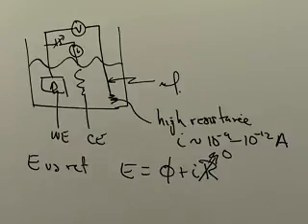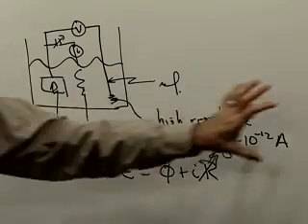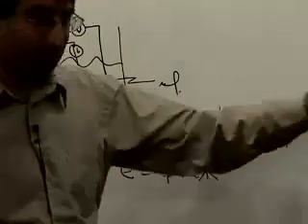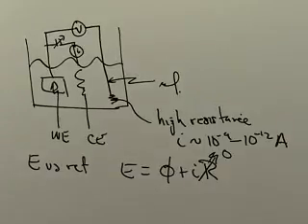Now, having said that, if you work at it really hard, you can mess yourself up and get such a high resistance between your working electrode and your reference electrode that even the trivial current is a problem. If you really want to mess this up, put a 5-foot-long salt bridge between your working electrode and some other container with your reference electrode in it. Make sure that reference electrode is as far away from the working electrode as possible, and the salt concentration is as low as possible. If you worked at it, you could get it up there.